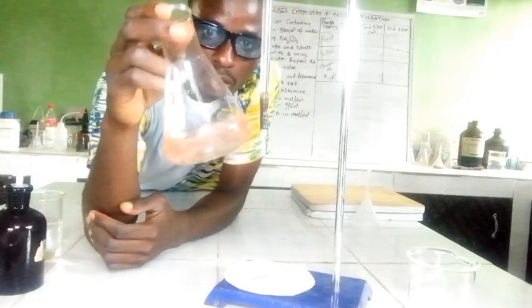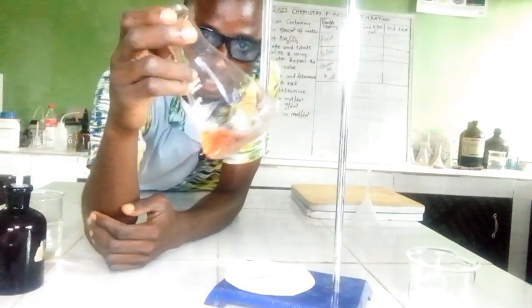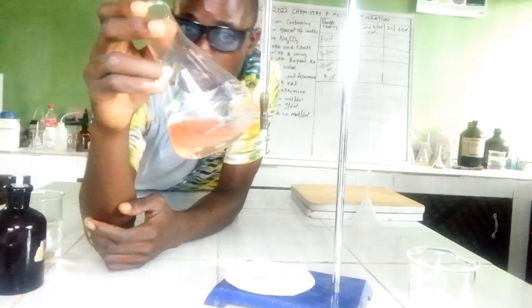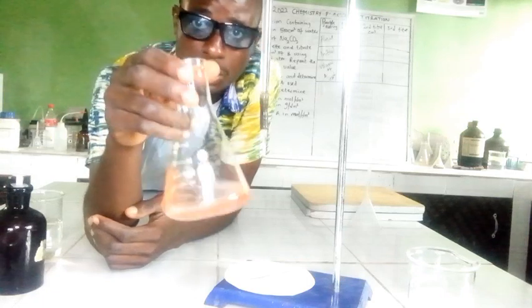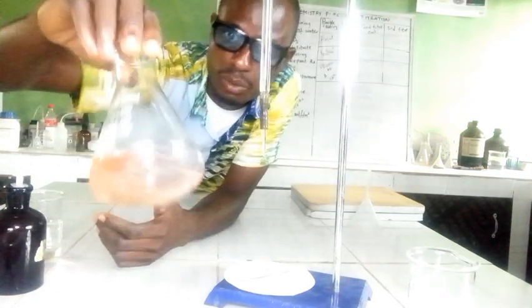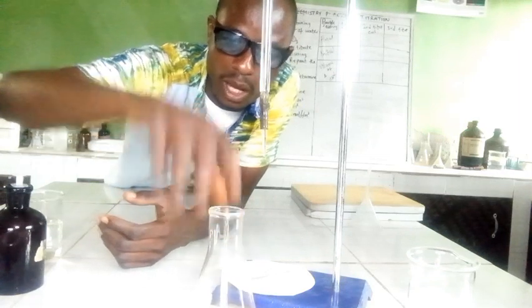What you see is a slight pink color. So immediately there is a color change, then the titration has ended. But this is no more yellow. It's no more yellow. So now I will record that.